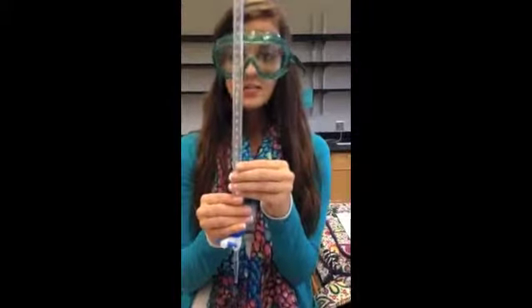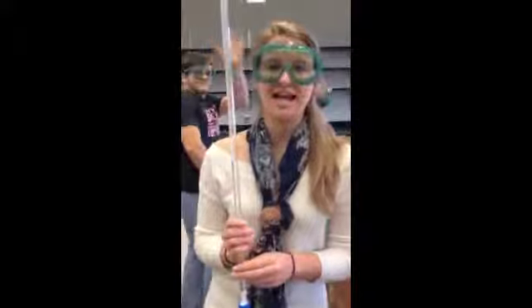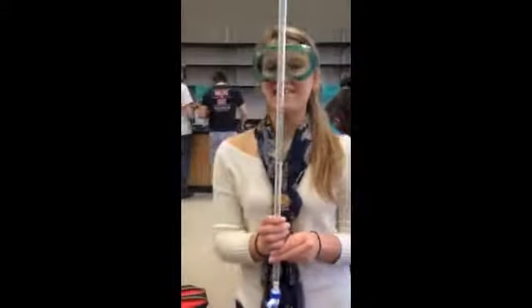The final volume for sample 1 was 24 milliliters, but we didn't get it on video. Sodium hydroxide in sample 2 is 17.5 milliliters. Final volume of the sodium hydroxide in sample 3 is 21.5 milliliters.